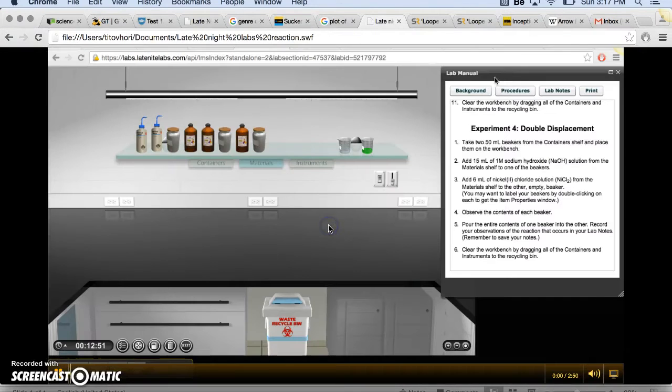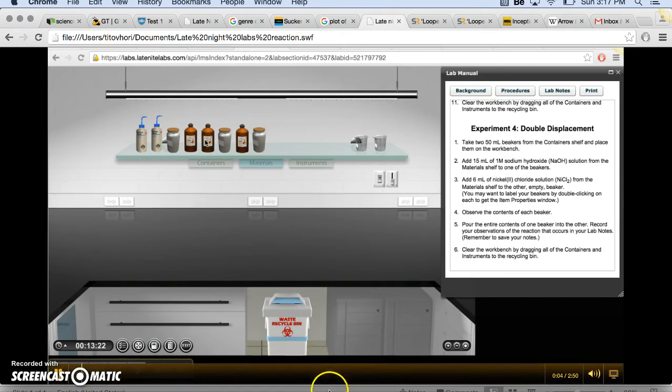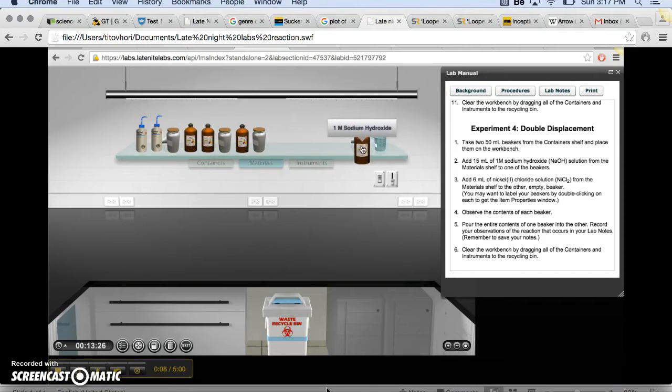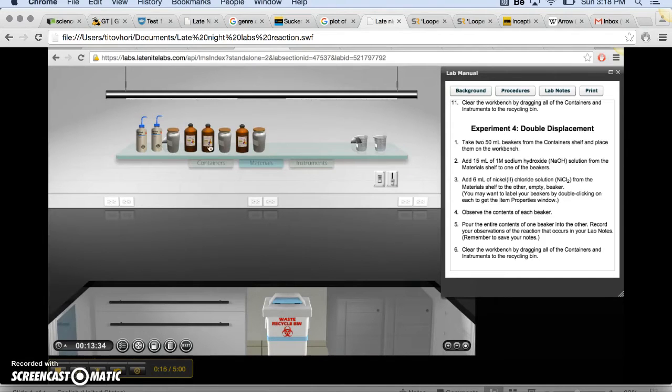Today we're going to be doing the reaction of nickel chloride and sodium hydroxide in solution. The first thing we're going to do is set up two 50 milliliter glass beakers, and we're going to take one molar sodium hydroxide and put 15 milliliters of it in our first 50 milliliter beaker.